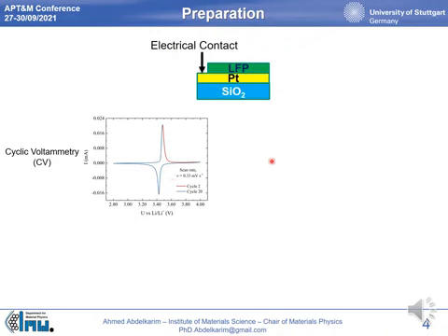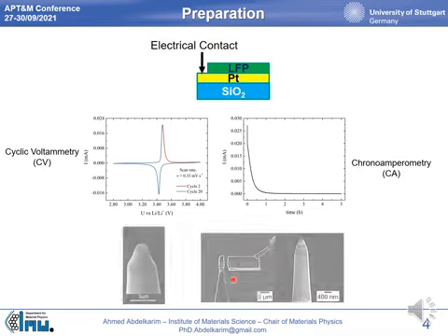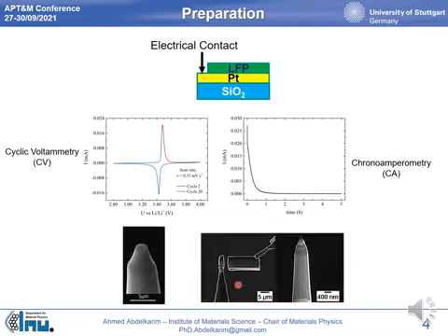Then we apply a constant voltage, here in this example 3.48 volt. We apply it for 5 hours. The aim of this technique, called chronoamperometry, is to equilibrate the lithium ions through the whole layer. Using the lift-out lamella method, the charged and discharged LFP tip was prepared.